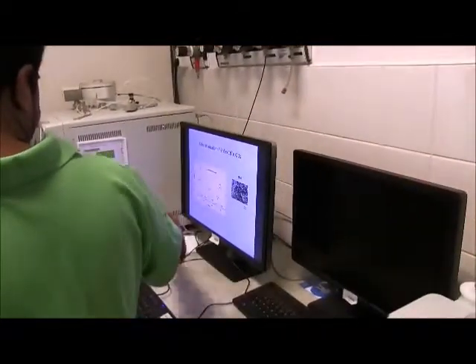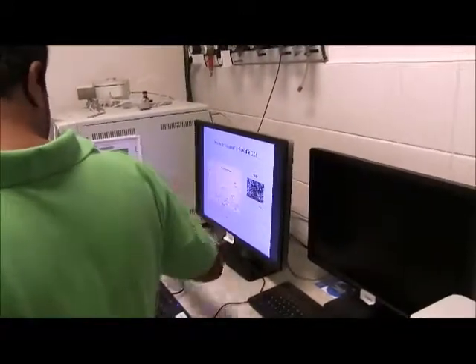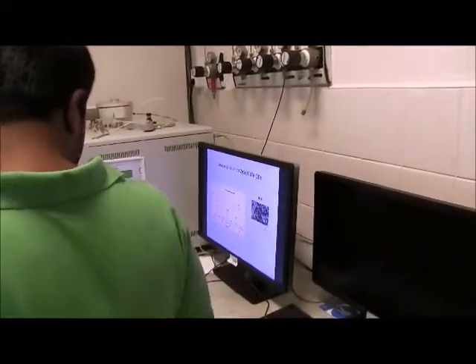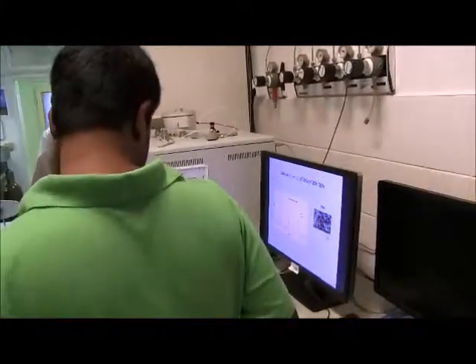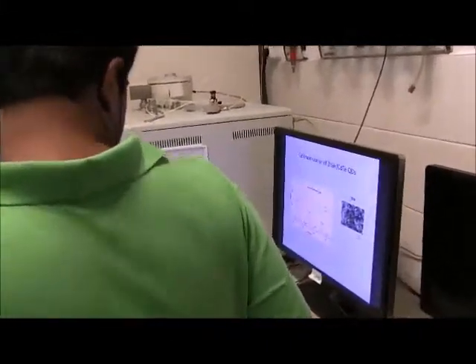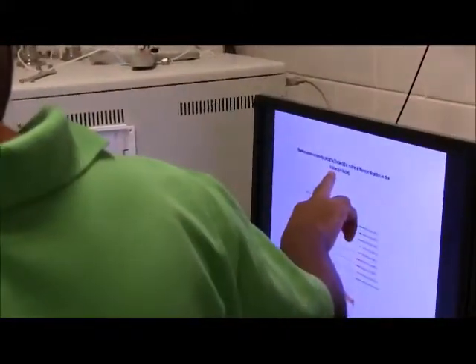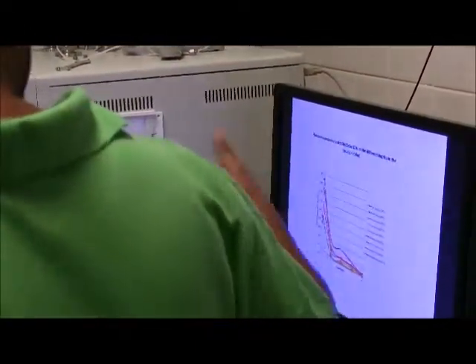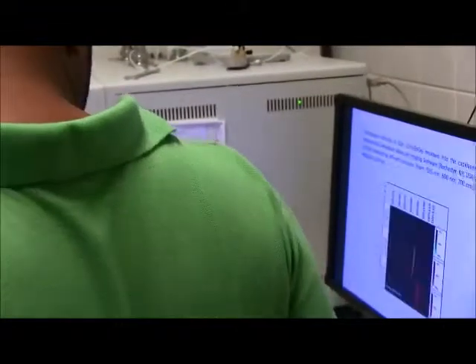This is the X-ray fluorescence graph from the machine. It shows all the metals or elements that we expected in this solution. And this is the TEM result, transmission electron microscopy. Maybe we need HRTEM, high resolution TEM, but we didn't have that here. And this is the fluorescence intensity of this quantum dot at different depths of tissues. This quantum dot was applied on the tissue, which I will show you next.